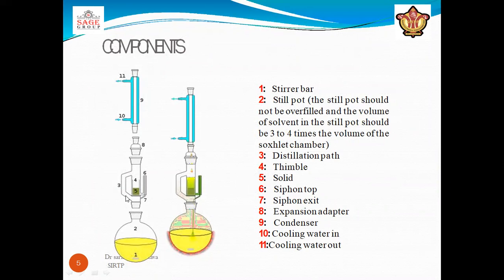The third is the distillation path. Fourth is the thimble. Then fifth is the solid. Sixth is the siphon top. Then seventh is the siphon exit. Then eighth is the expansion adapter. Ninth is the condenser. Tenth is the cooling water in. Eleventh is the cooling water out.